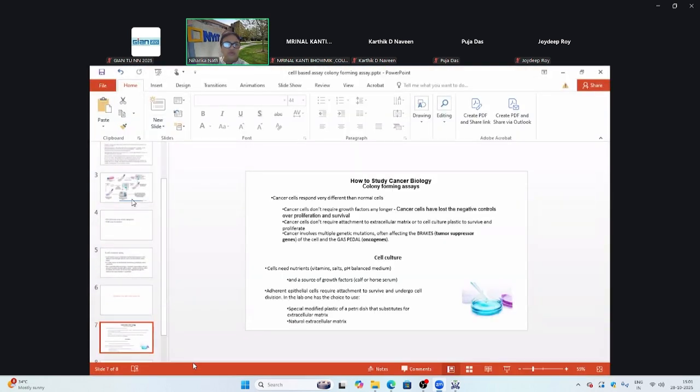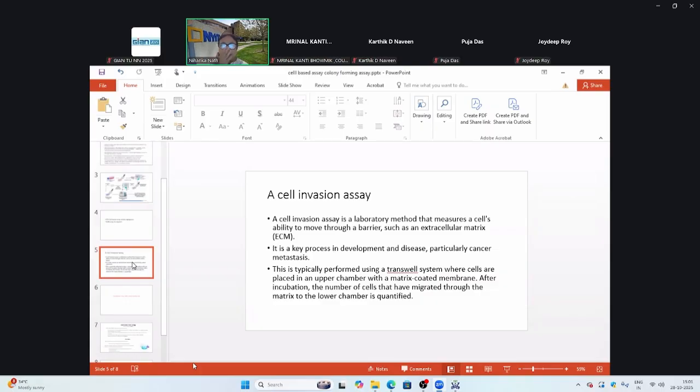So what you saw there was actually the transwell assay, probably in a similar but different video. I didn't realize that the transwell, with one well on top of the other, was not there, but it was still the same concept.